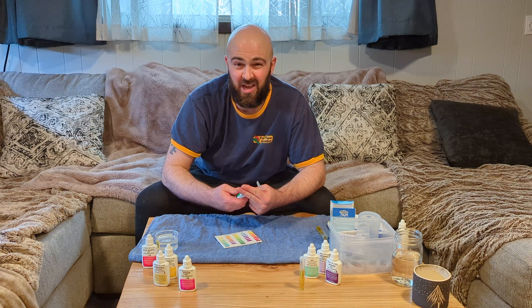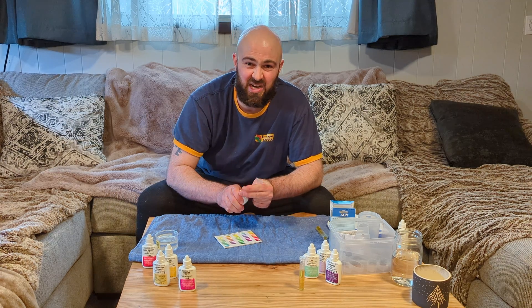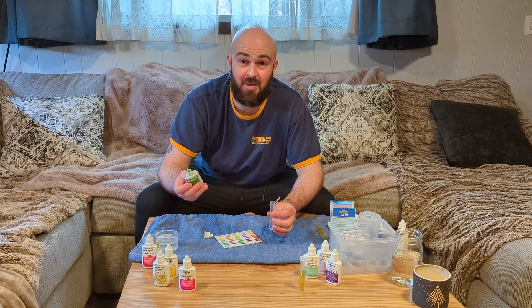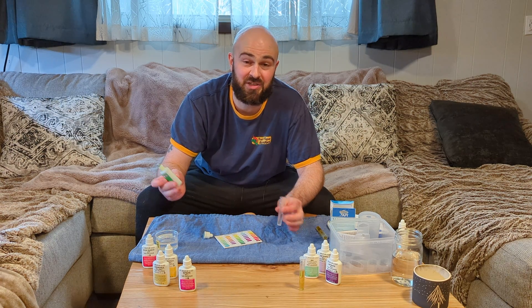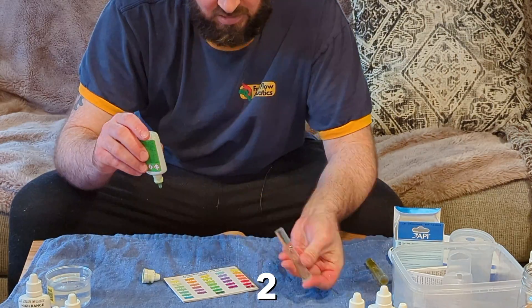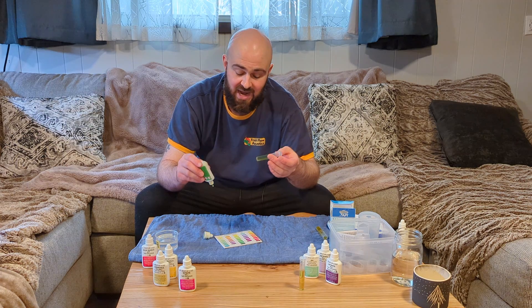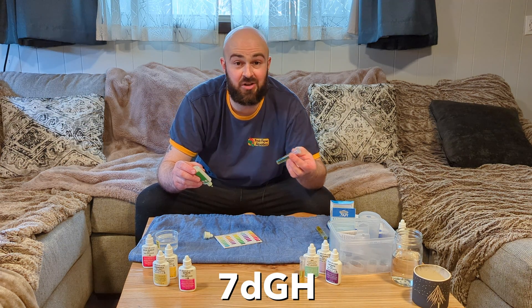This is actually a test kit by Fritz, but it works in the same exact way. Again, we're just going to be adding one drop at a time, inverting, and waiting for it to turn green. Just turning green — that means I have seven degrees of general hardness.